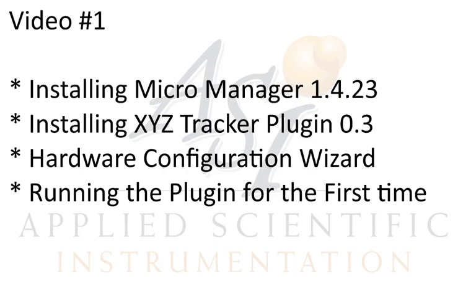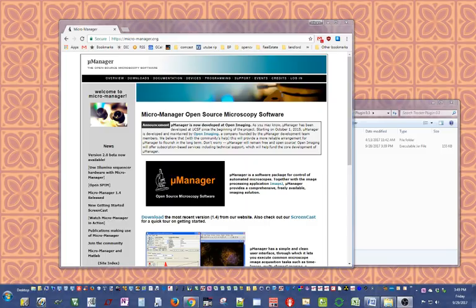Hello everyone, welcome to the videos related to ASI's XYZ tracker plugin. This is video one, and in this video I hope to walk you through installing MicroManager, installing the XYZ tracker plugin itself, running through a hardware configuration wizard of MicroManager, and a few other tasks that might help you running the plugin.